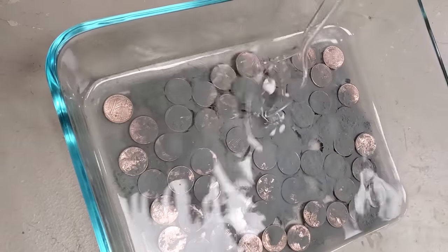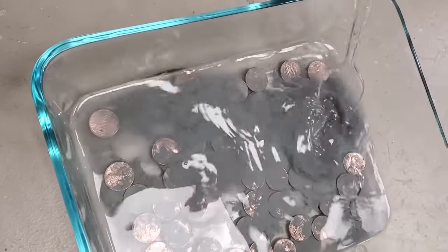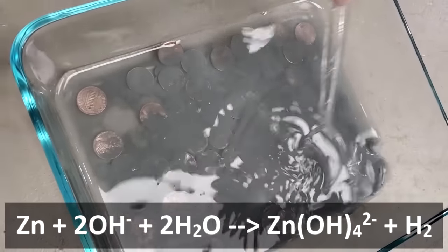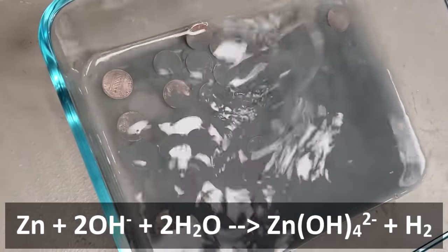This experiment has been popular among chemistry teachers for decades, but all the write-ups on it seem to gloss over how incredibly cursed it is. The first part of the reaction is nothing crazy: zinc reacts with hydroxide in the presence of water to form the zincate ion, along with some hydrogen gas. So how does this end up plating the copper? Well, this is where things get sticky.